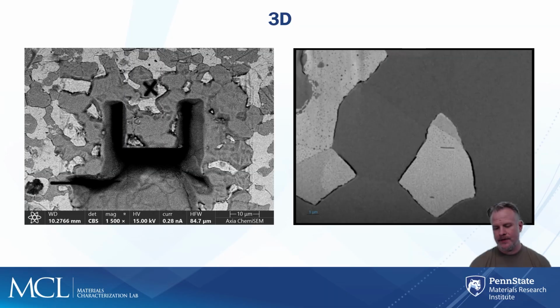Let me back up a moment and point out this is the field of view that I want to do the reconstruction in. What I care about in this instance is the tin background, my lead grains, and most importantly this gap, these really dark spaces in between, which isn't the same all the way around the grain. There are areas where it's tighter and areas where you obviously have a greater gap. So that's what I'm going to be looking to reconstruct in the following images.